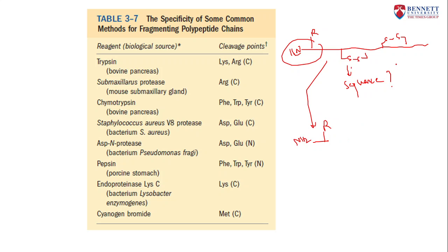Next, you treat it and break down the cysteine linkages, using the treatment that we just described. So this is N-1 already.